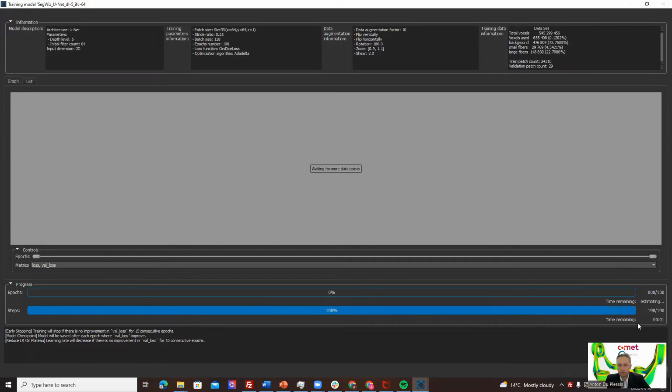The first preview frame will probably not be great, but let's have a look.